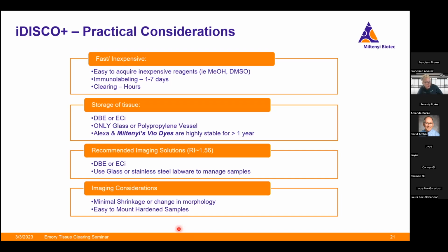I want to say one more comment on this. I'm sorry, I'm adding a lot of comments. Please. So we talked about this idea of using aqueous clearing for expansion microscopies. The idea of that is you blow it up on purpose so that you can see these small resolved structures a little bit blown out, and you can get that resolution because of it. It's likely a little bit the opposite here. If you have some sort of shrinkage, you don't want to be looking at super tiny structures, because as it shrinks down, that's going to be reduced.